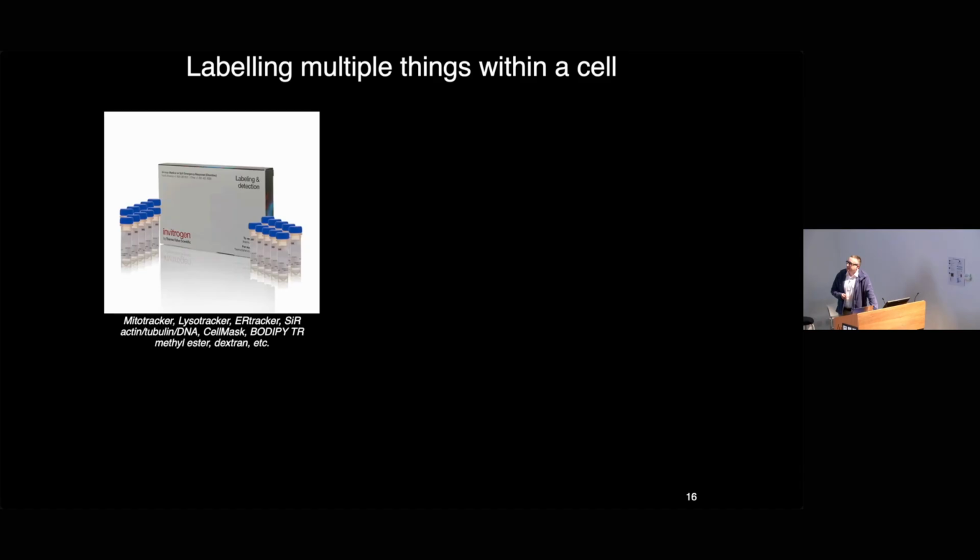So if you're interested in organelles or, say, the cytoskeleton, you can now buy quite a lot of different live cell imaging dyes from suppliers such as Thermo Fisher and Spirochrome. Add those to the cell media, wash it out, and for general imaging they seem to work pretty well, and spectrally they're nicely separated because you can get them in lots of different colours.